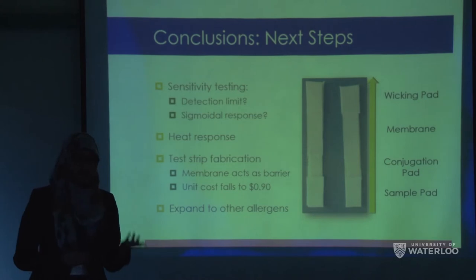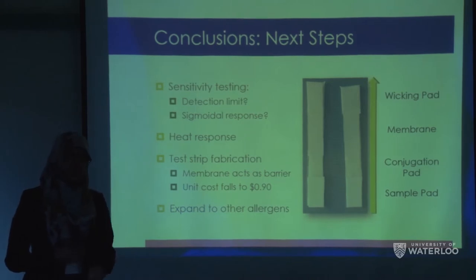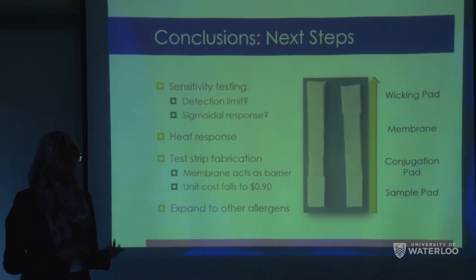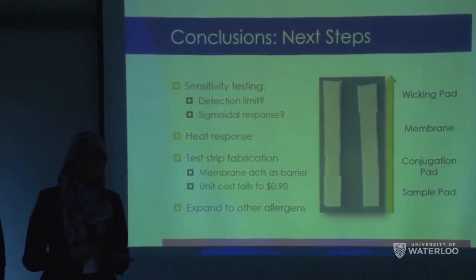So for our next steps in that same line, we want to increase sensitivity by checking what our detection limit fully is. We know it already works at the concentration we need. But we want to be able to test its full capabilities and find its limits. We also want to be able to find its response to different concentrations, and its response to heat. So our patients will, of course, use it with hot food as well. We need to make sure that doesn't change results in any way.